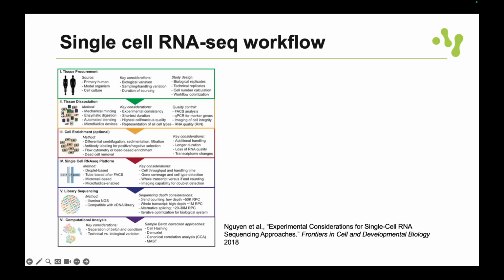And you need to spend a good amount of time on having a good tissue dissociation protocol, because it's really key to have high quality cells to get high quality data. If you don't have that, you will not get the best possible outcome from your experiment. If the cells are dying, you will see dying cells in your data. Probably you will filter them out, and that's not what you're aiming to look at in your project. You want to have the best viable cells possible.